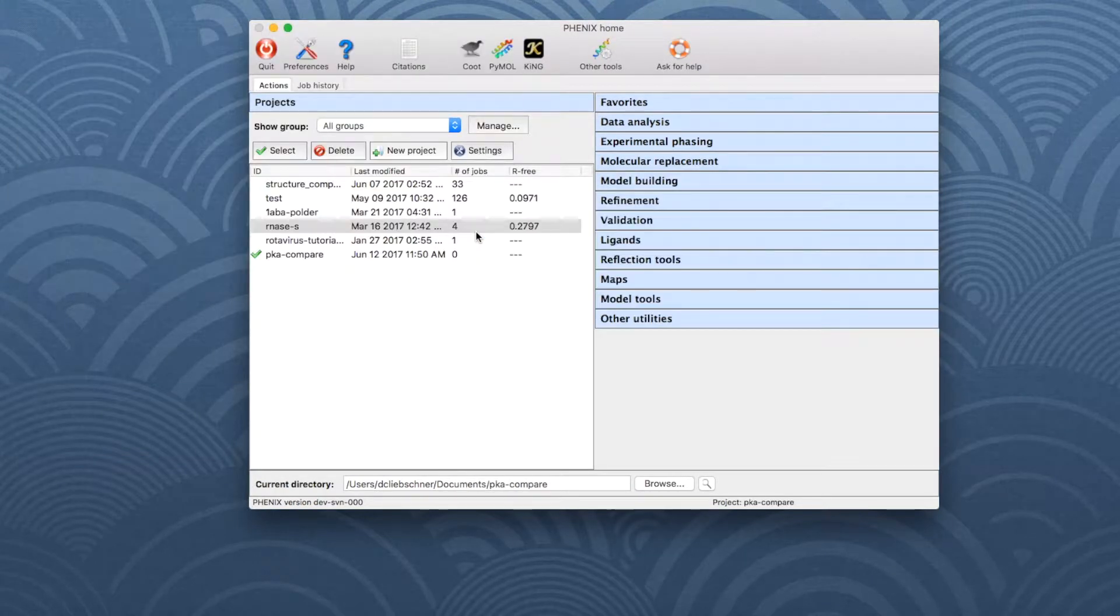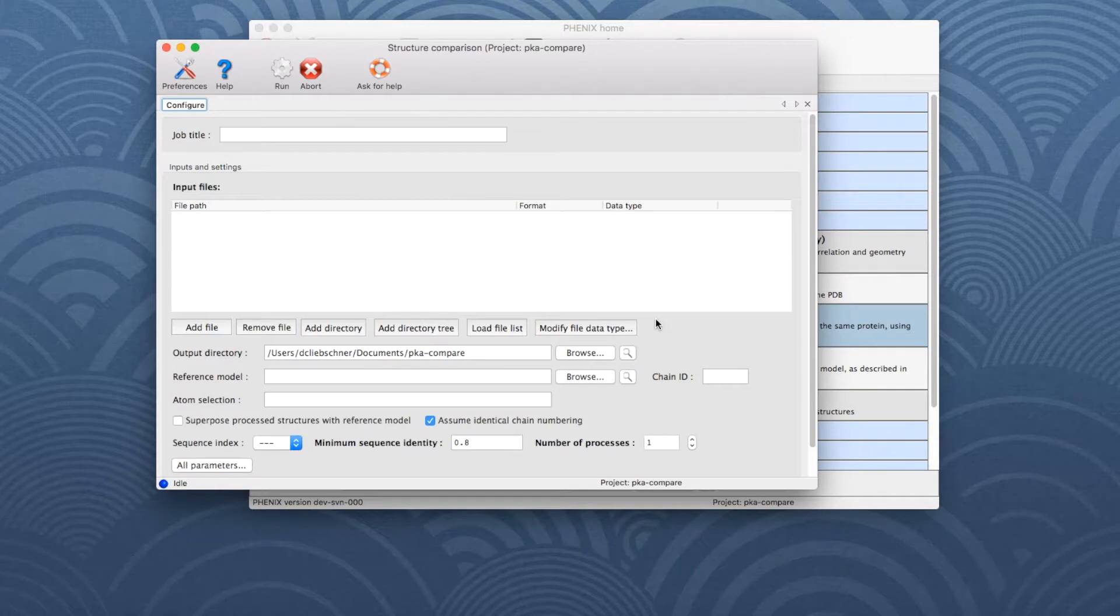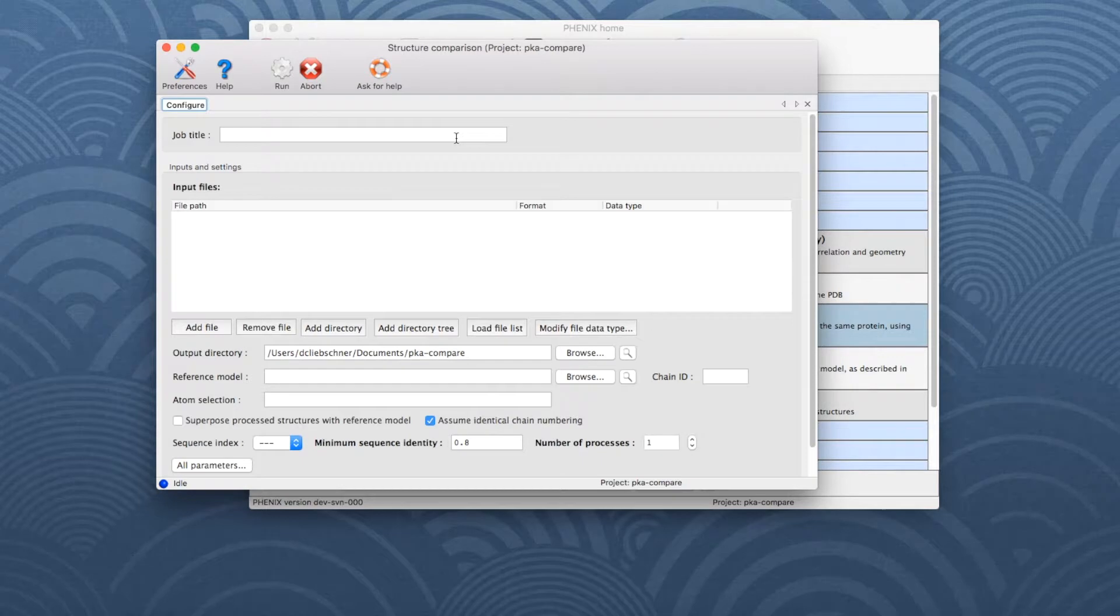To run Structure Comparison, choose Validation and then click on Structure Comparison, which opens a new window. For bookkeeping, add a job title.